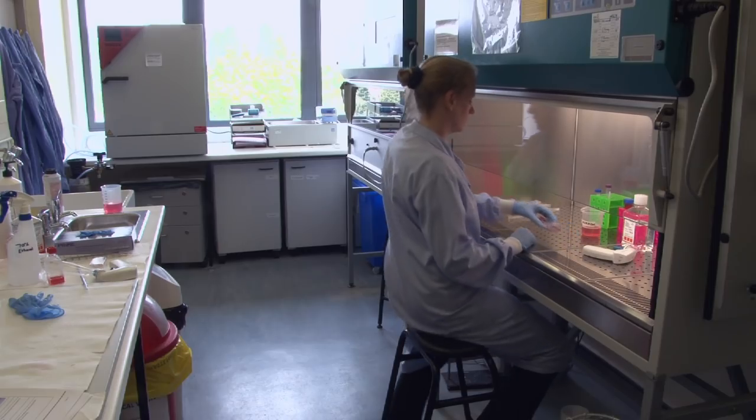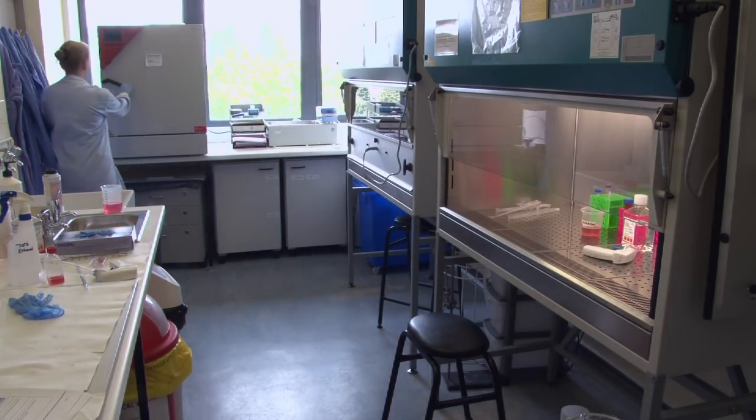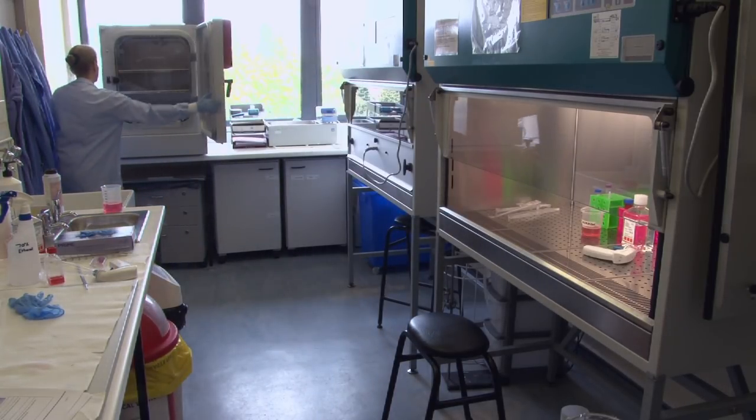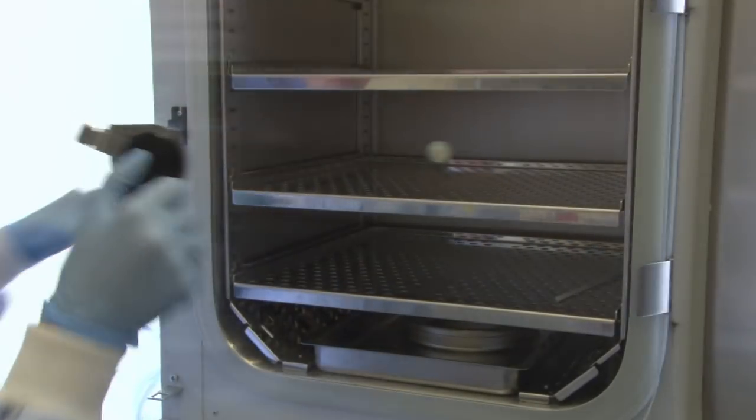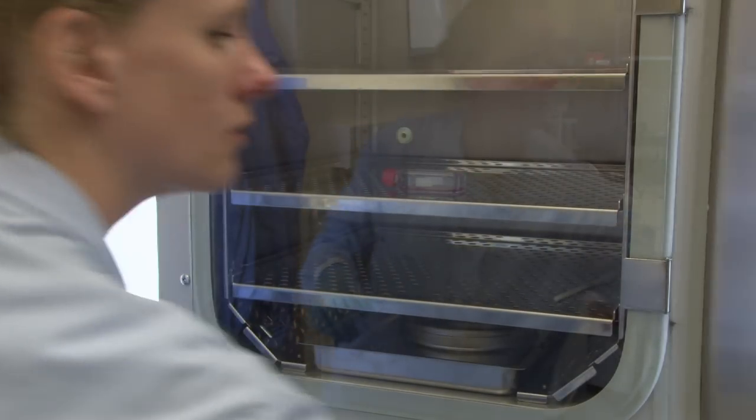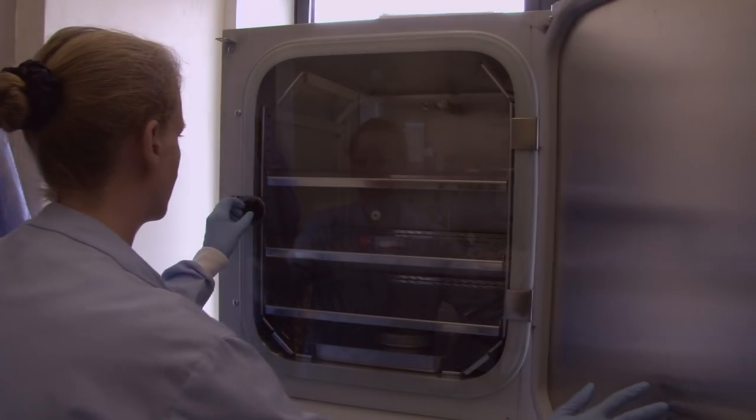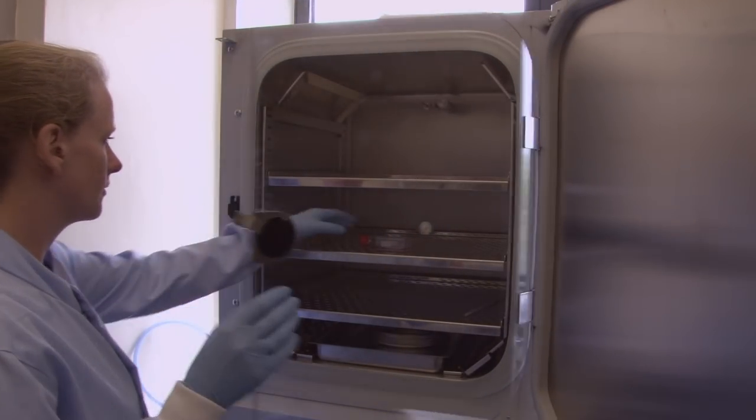The trypsin is a digestive enzyme, and works most effectively at 37 degrees centigrade. Put the flask into an incubator for three to four minutes. Don't leave the cells in the trypsin for too long, or you'll remove the cell's surface signaling proteins.